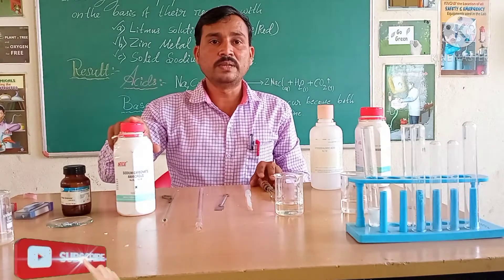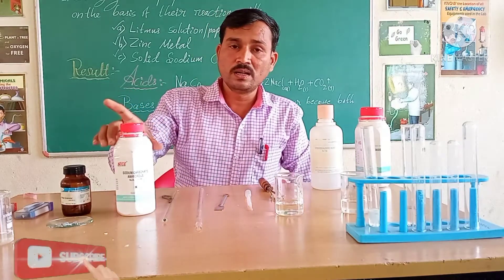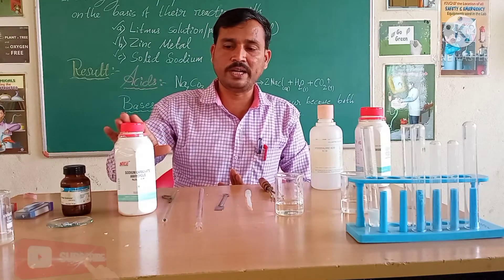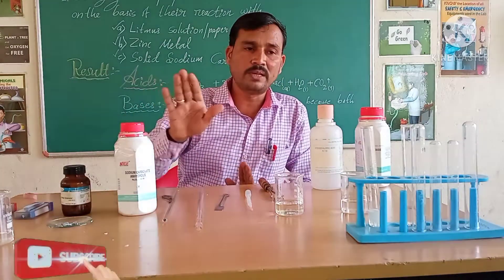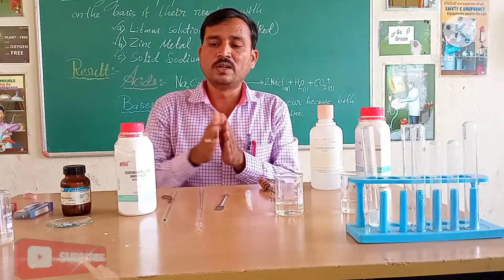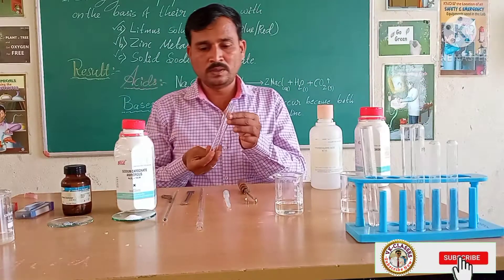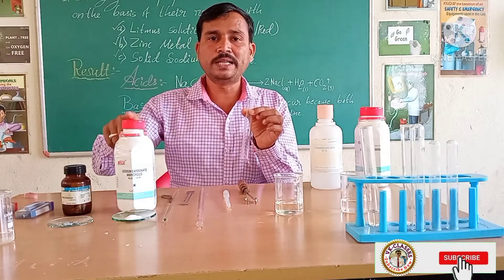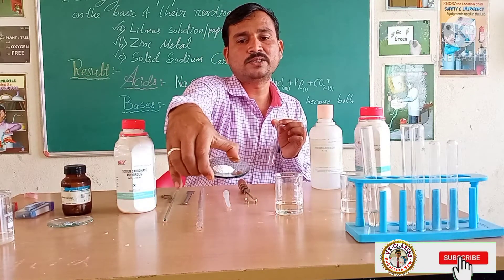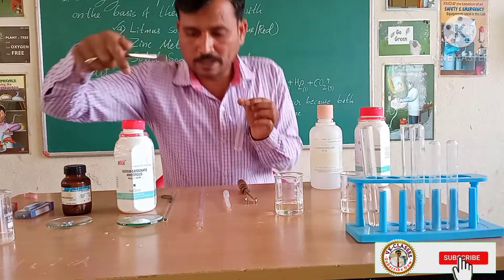Now the third: what happens with the property of acid and base reacting with solid sodium carbonate? Let us check the sample of solid sodium carbonate with respective acid and base, using two test tubes — one with acid and solid sodium carbonate, another with solid sodium carbonate and basic sodium hydroxide solution. I will take one test tube and add a sample of solid sodium carbonate.